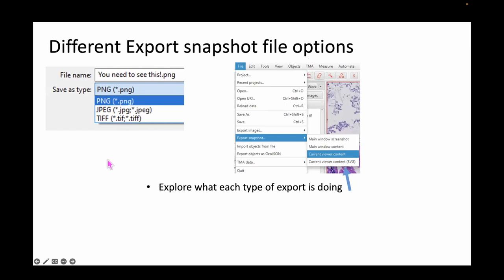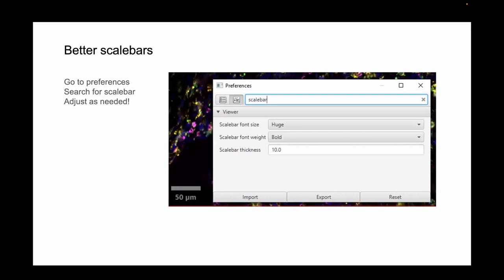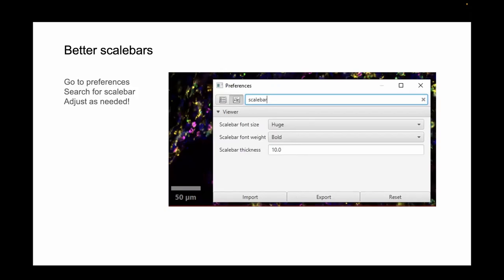There are other export options worth exploring on your own later. I recommend PNG for quick emailing. This is not a scientific-quality image — for that, go to Preferences and make the scale bar huge and bold; increase the scale bar thickness and give it a try. The scale bar is designed to adapt across different image types and magnification levels.